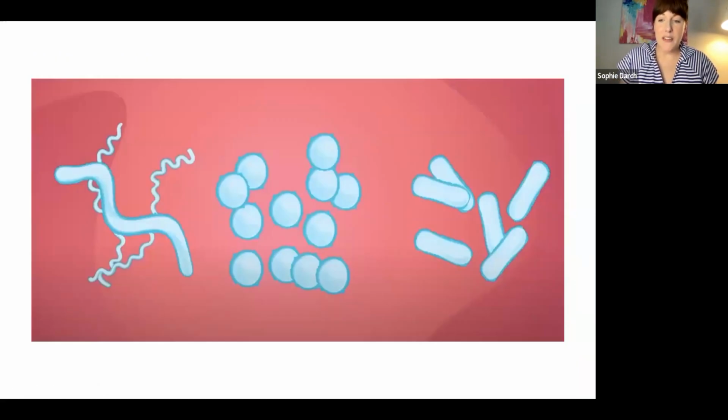As we look at these different microscope images, a little reminder: I'm sure you've touched on this before, but bacteria are very diverse in terms of what they look like. The ones that I study are here, the bacillus or rod-shaped bacteria. They can be round, spherical cocci bacteria, but there are also some really cool ones that are spirals, what we would call spirochetes, that you might find in the oral cavity. If you're having guest speakers in your sessions, you might come across some of these really cool different shapes of bacteria. That's something to keep in mind.